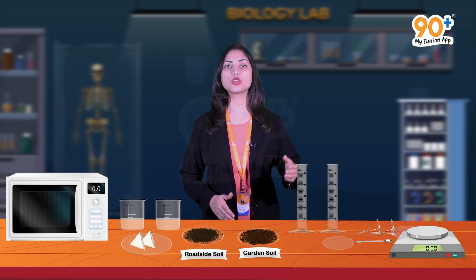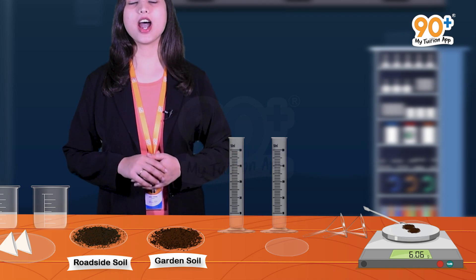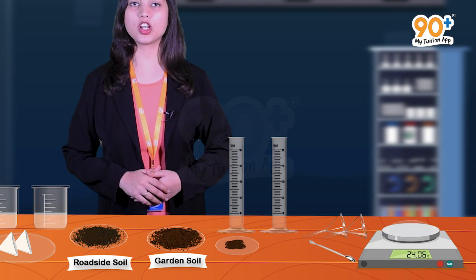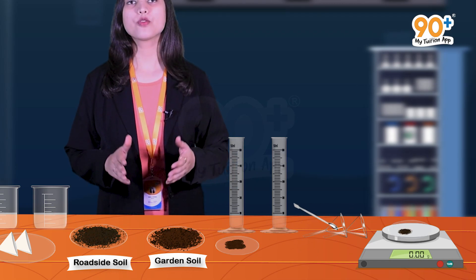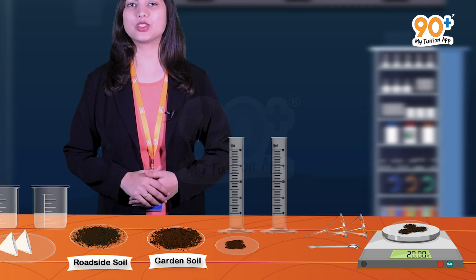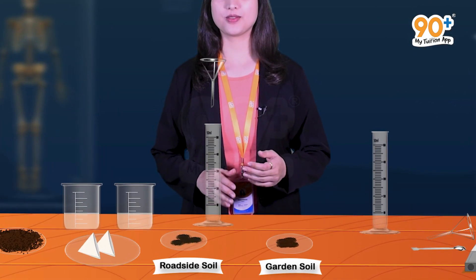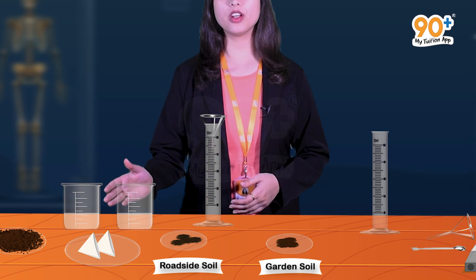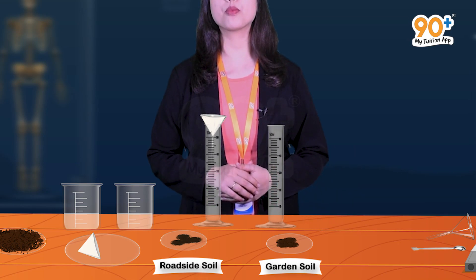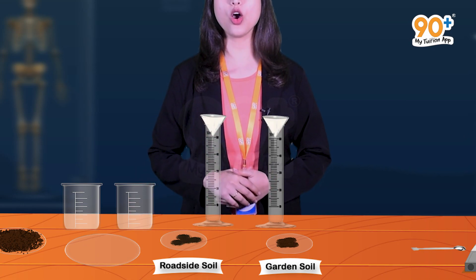First we will keep a watch glass on the weighing balance and then tare it. Using a spatula, we will add garden soil to the watch glass until it reaches 20 grams. Likewise, for weighing roadside soil we will take another watch glass and tare it, then transfer the roadside soil to the watch glass until it reaches 20 grams. Now we will take a measuring cylinder, put a funnel over it, fold a filter paper in the shape of the funnel and place it over the funnel. We repeat this setup with a second measuring cylinder, funnel, and filter paper.